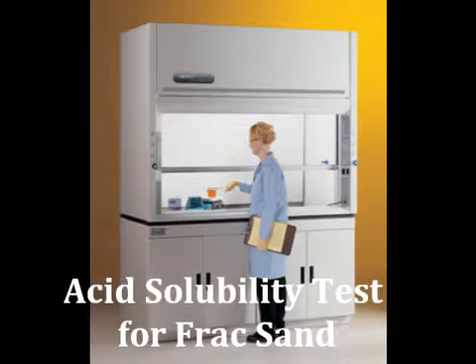Okay, this needs to be done on unaltered whole grain sand. You don't want to use anything that's been crushed for the crush test. And it uses hydrochloric and hydrofluoric acid. Nasty stuff, hydrofluoric acid is. Can kill you pretty quickly, actually. It's pretty nasty. So you want someone experienced to do this and under a good hood so that the gases evolved, fluorine gas possibly, aren't inhaled.